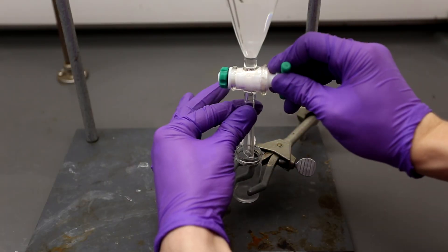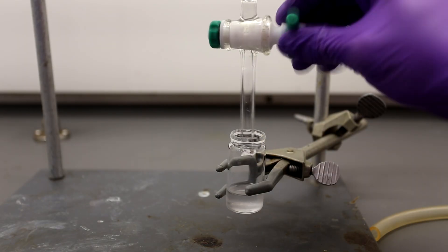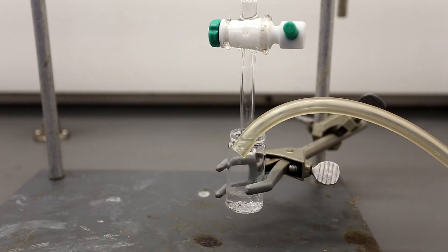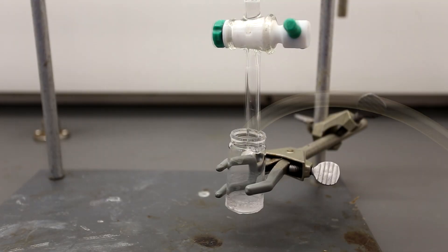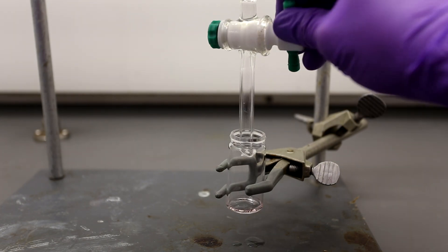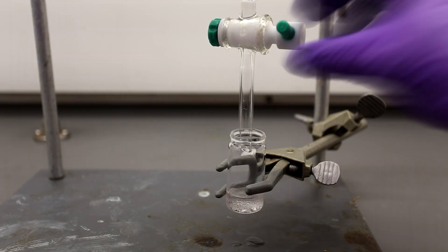I used a separatory funnel and a small vial to evaporate the ether. I opted to use this method because using a rotovap could stink up the lab. This way the butyric acid stays in the fume hood the whole time.